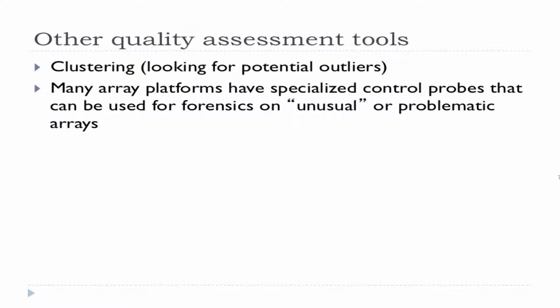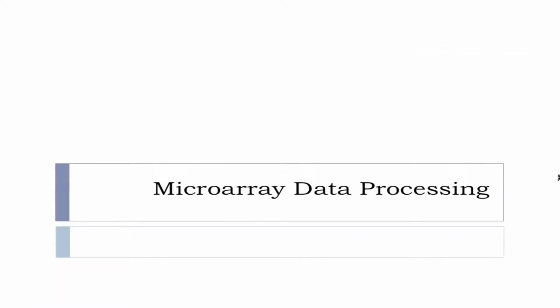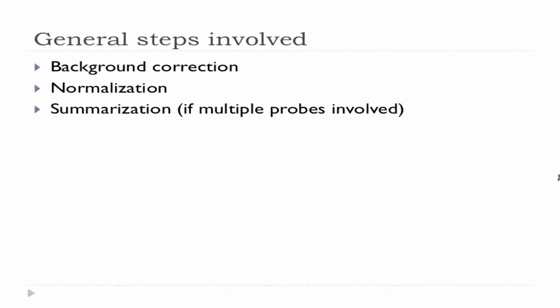So now we're getting into the data processing. Any questions on the QC side of things? Okay. I'm going to talk really quickly about background correction. Then we're going to spend a little bit of time on normalization and just touch on summarization.